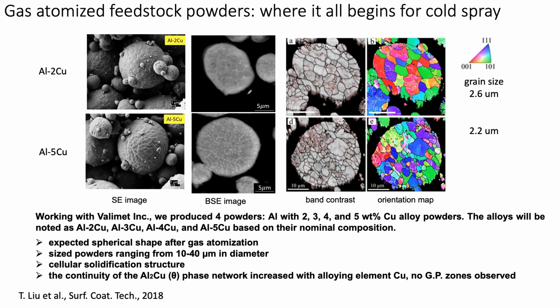So let's keep going. Okay, so now back to cold spray. It all starts with gas atomized feedstock powders. That's where it begins for cold spray. This is work by Tien.